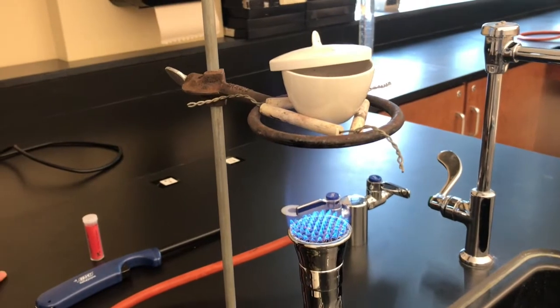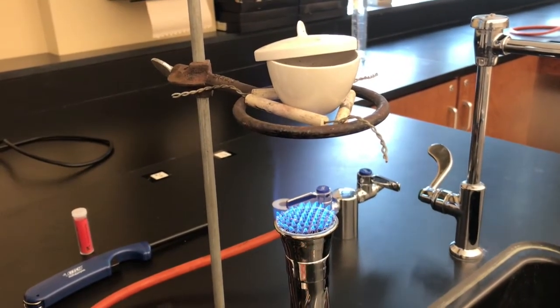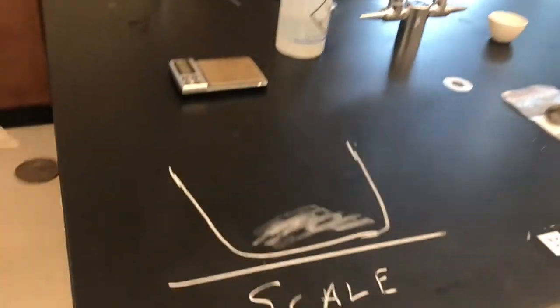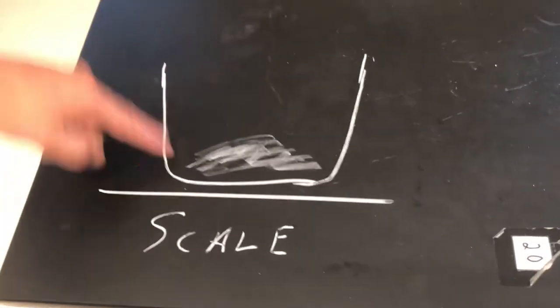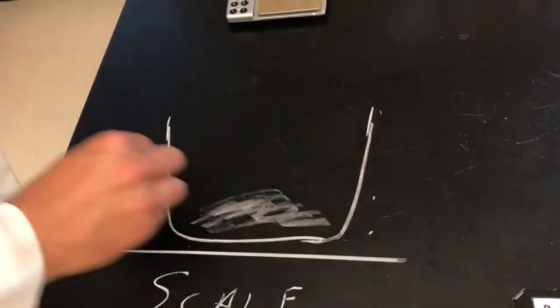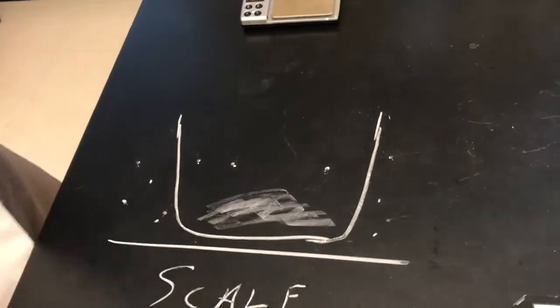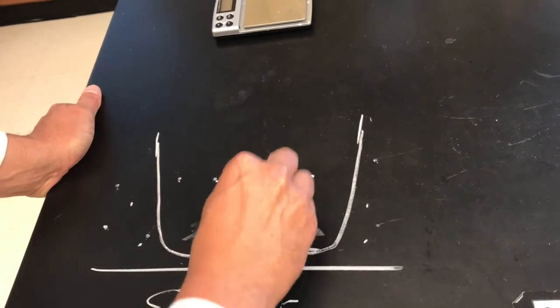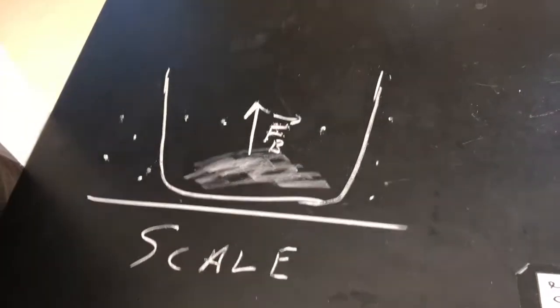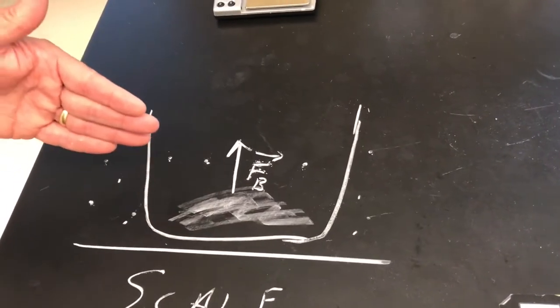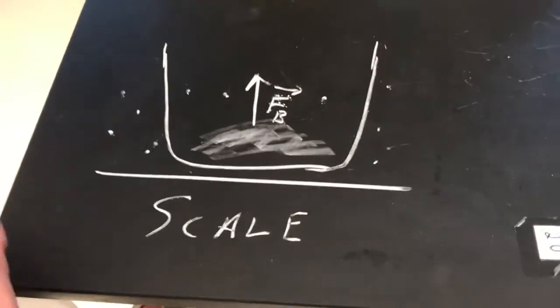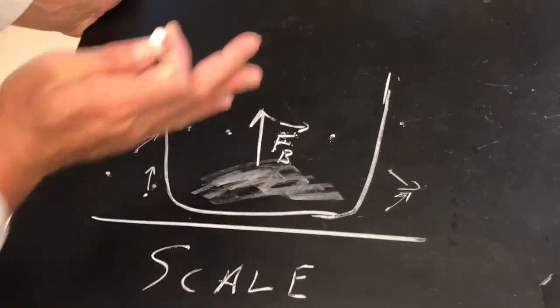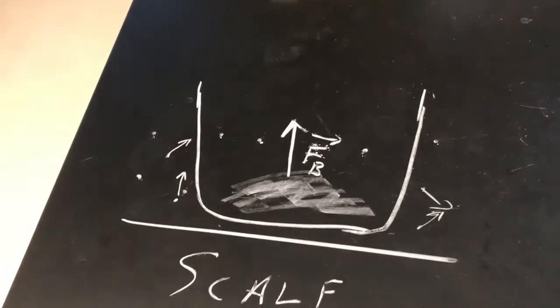Now we're going to mass it again — the crucible, lid, and the magnesium oxide. But it's really important to understand that you can't mass hot things. Imagine putting something really hot on a scale. This hot crucible is going to heat up the air molecules, and hot air rises, so it's going to produce a buoyant force. A really hot crucible weighs less than it really does. That's why it's important to let things cool — plus it's probably not good for the scale. All those air molecules gain lots of kinetic energy and actually lift the crucible up a little bit.